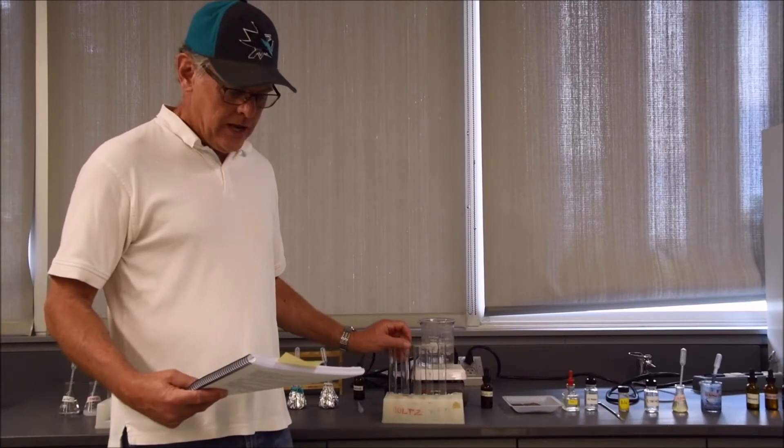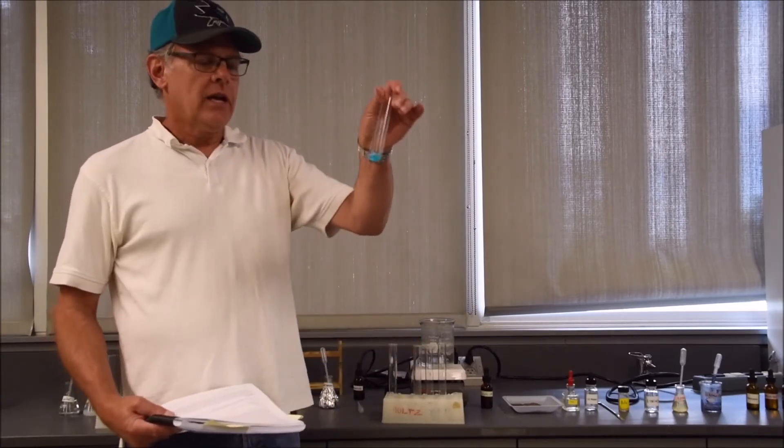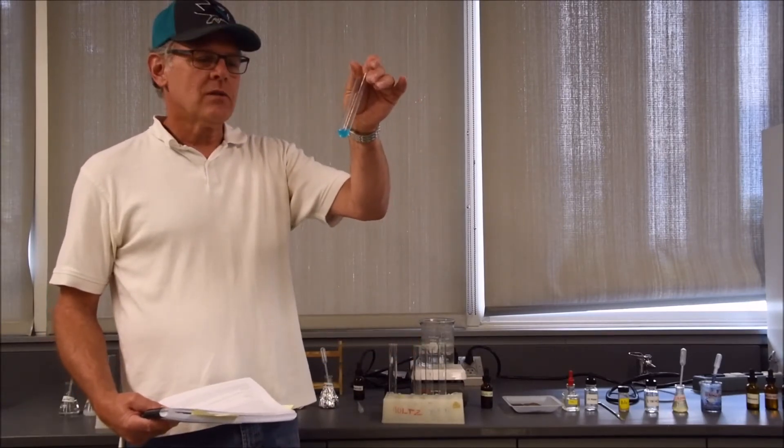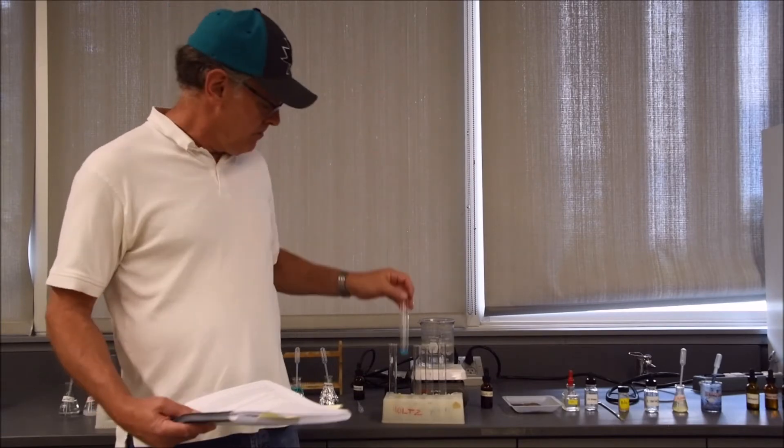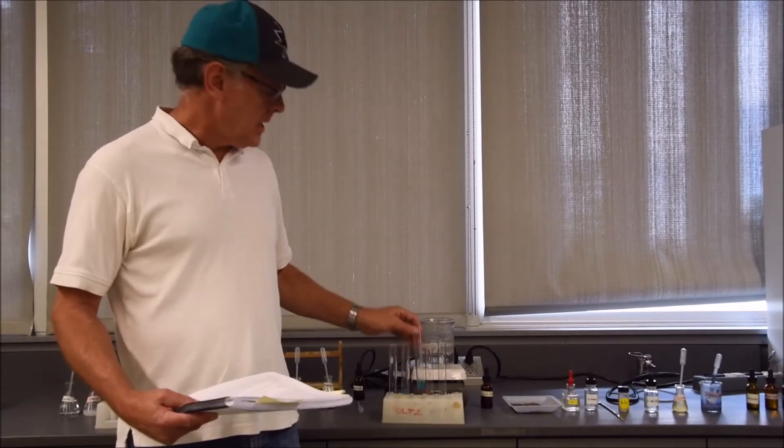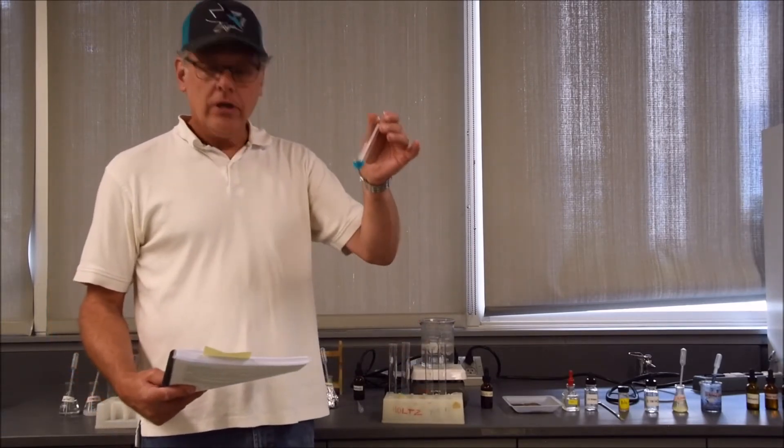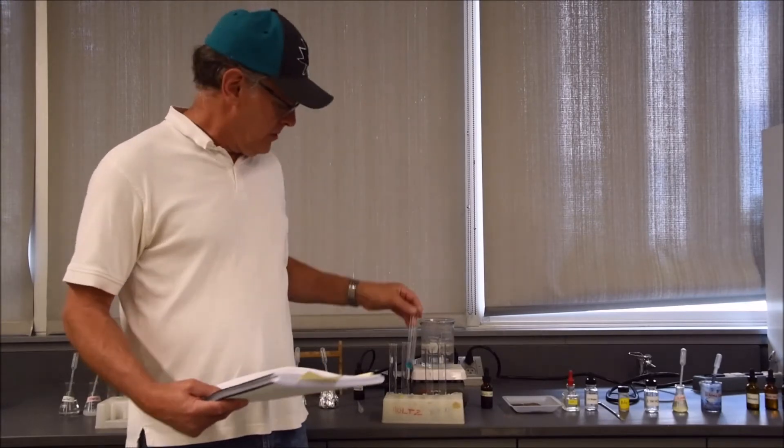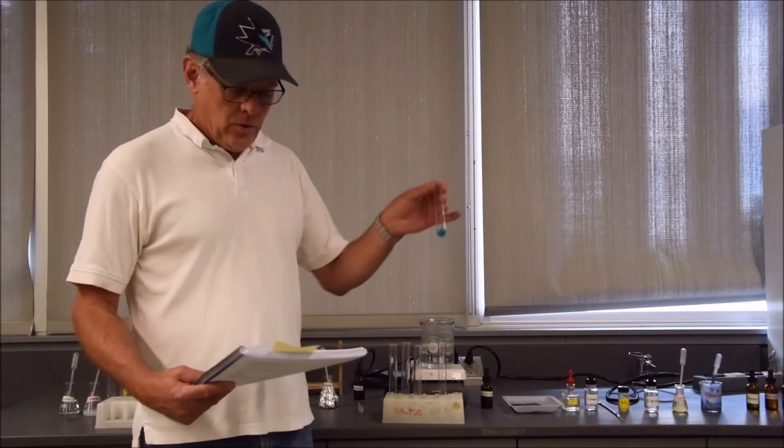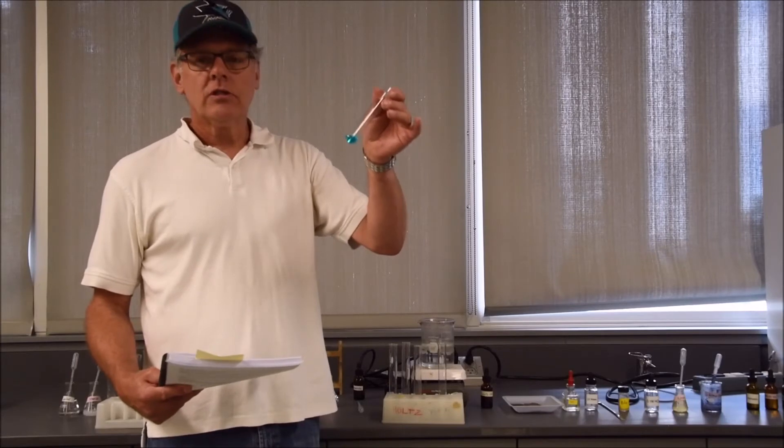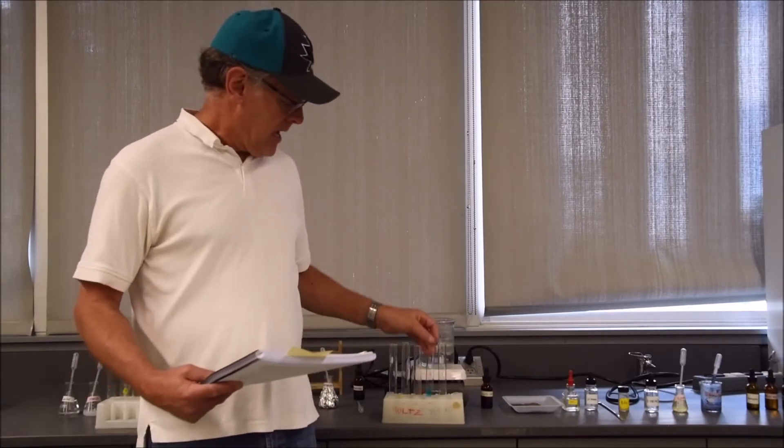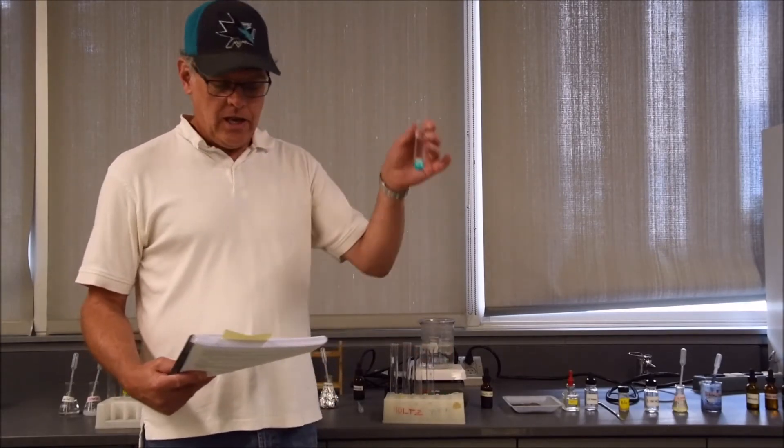Tube number two has starch, again kind of a blue color, although this time it's a little bit creamy blue. The starch has a little bit of color to it. Glucose is number three, also blue. Number four is onion juice with the Benedict's, and number five is a potato slice.